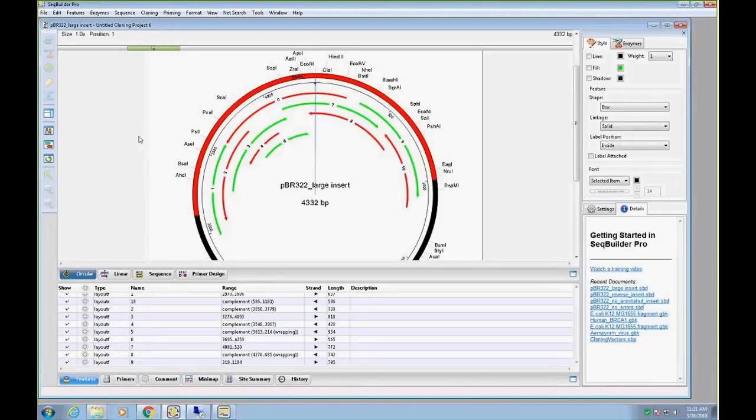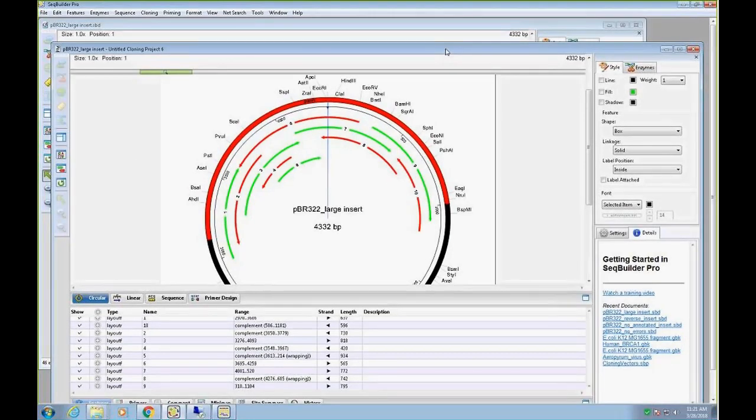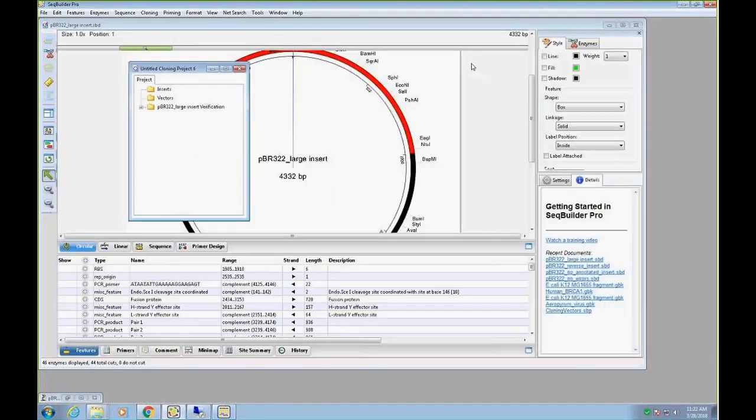We can do that alignment, no problem. So that's the different steps. Again, different scenarios where we have lots of variations, reversed inserts, other kinds of issues. This feedback, when we do this verification, will tell us that we've got these sorts of issues.